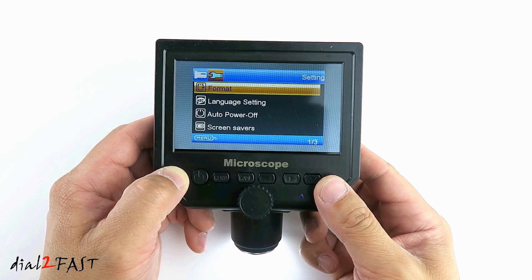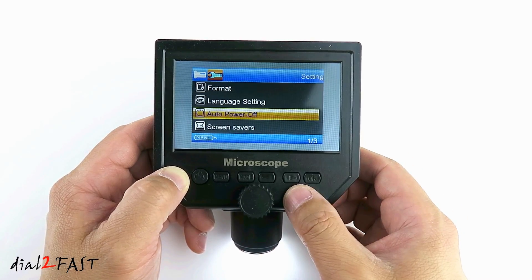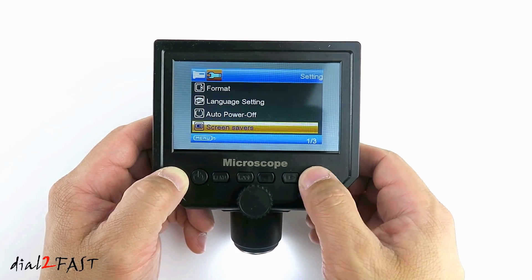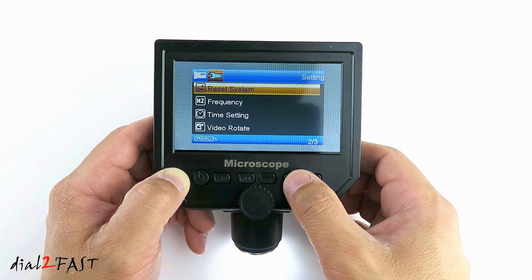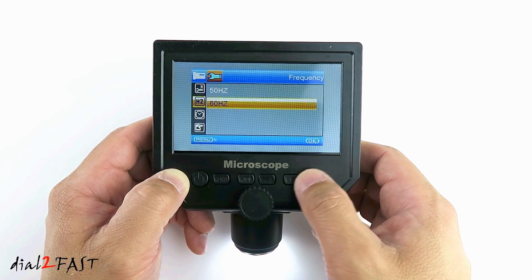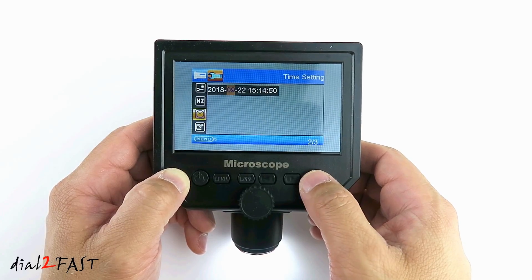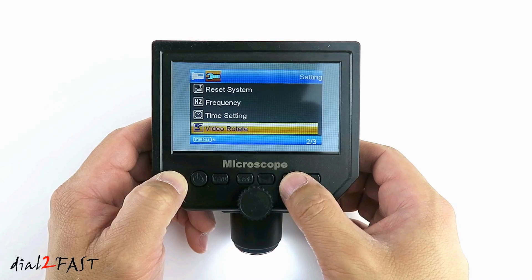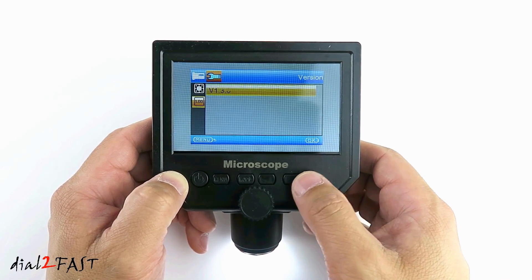After you install the memory card, you can go into format to format the memory card. Next menu is language setting. Auto power off — defaults off. Screen saver — defaults off. Reset system, if you want to reset to factory default. Frequency: 50Hz or 60Hz. Time setting — here you can set the time. Video rotate — to rotate the image. Fill light — by default on. Version of software.